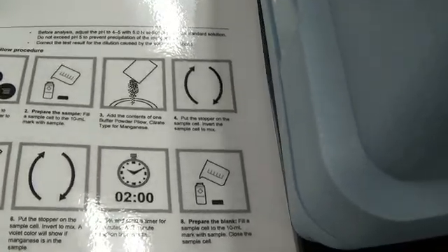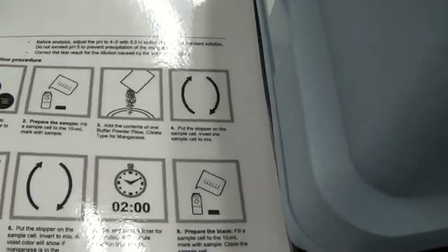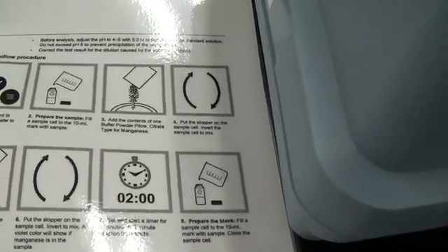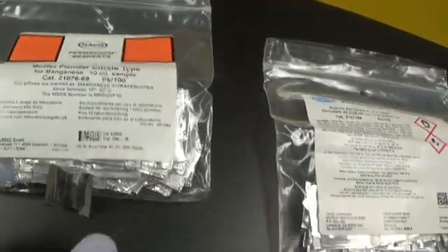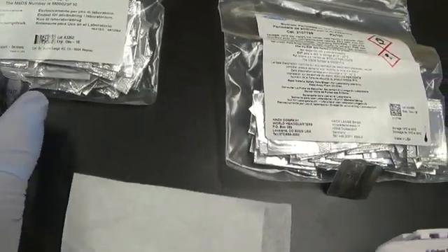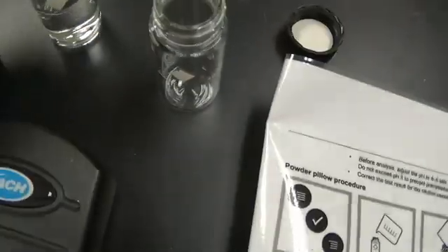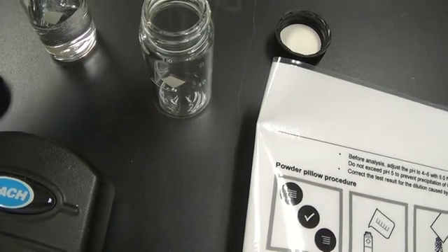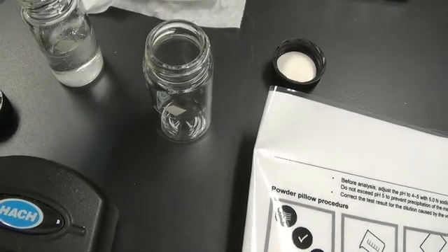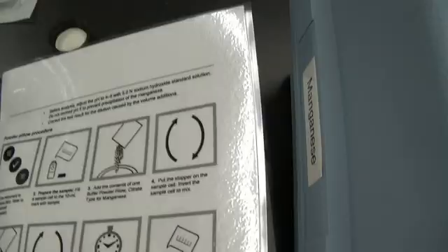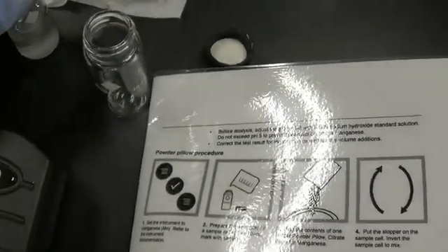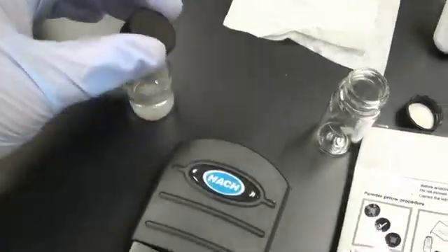Next, we add the contents of one buffer powder pillow, citrate type for manganese. I've got that here. I'm going to add that. Then I put on the stopper and invert to mix. There we go.